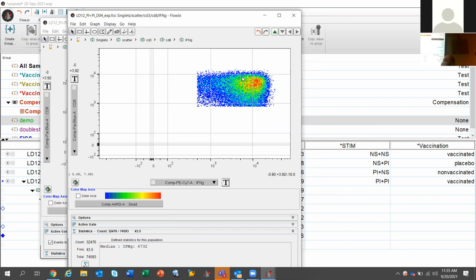And unfortunately, again, people that are new tend to take the prior gate, the parent gate of this, and call that the MFI. Next thing I want to clarify, MFI does not mean calculating the mean. You actually calculate the median, okay? Why?